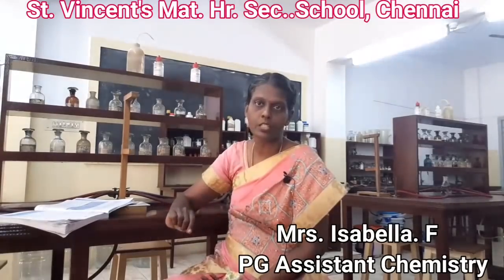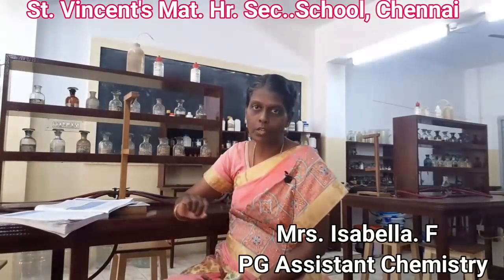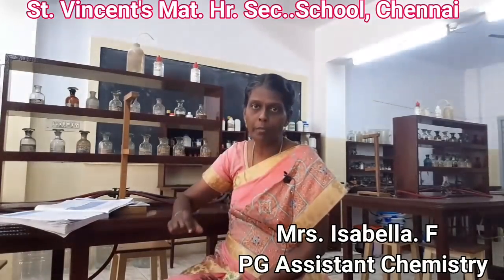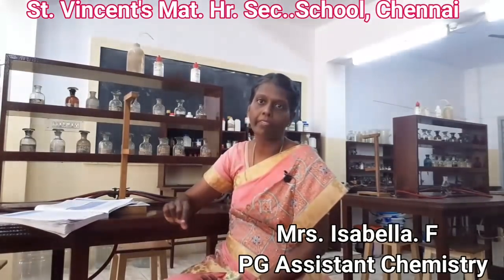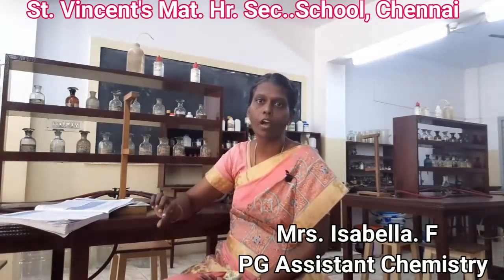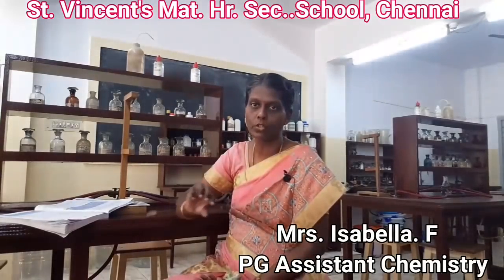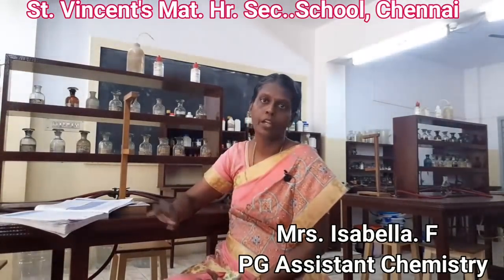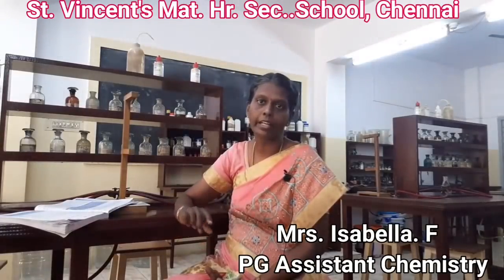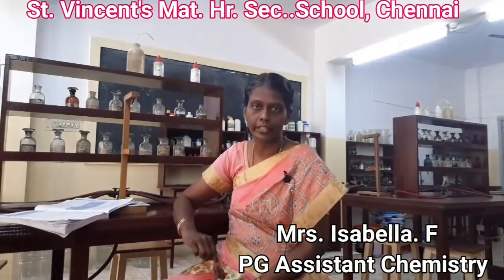The standard solution is the one for which the normality will be given, and it will also be mentioned to estimate the amount of. So the solution which comes after that is your unknown solution. And the link solution also will be specifically mentioned. So read the question, and accordingly the simple procedure will be written.